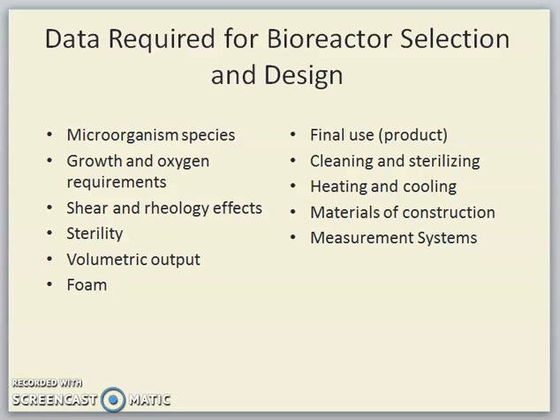Okay, talking about the materials, usually for the fermenter we use stainless steel. And you know that there are different grades of stainless steel, and the widely used one is 316.